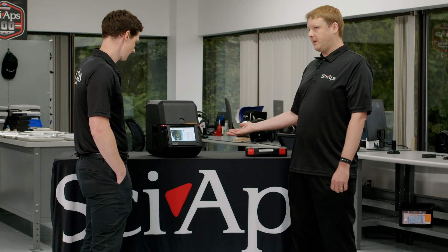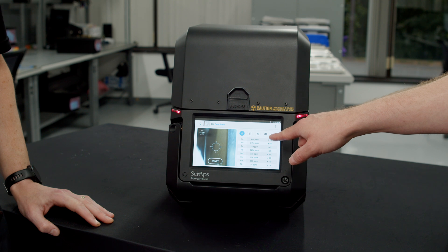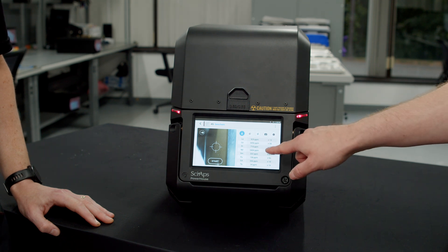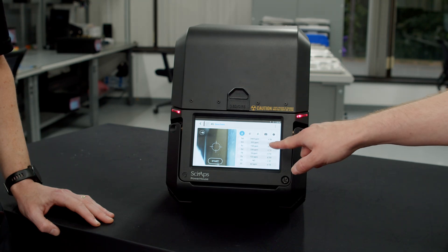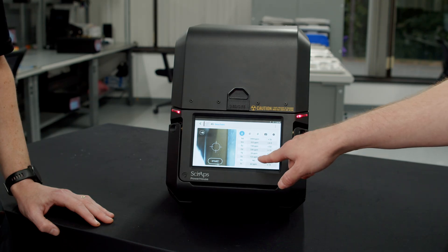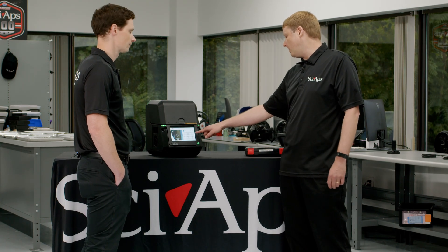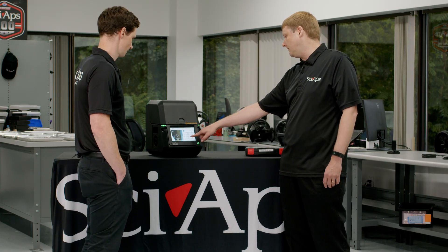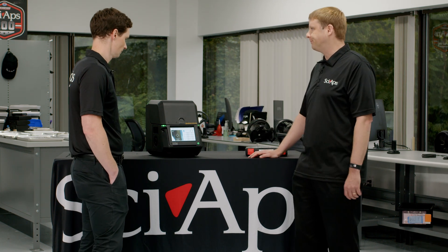This sample shows lower PPM levels of a bunch of rare earth elements. You have the light rare earths — lanthanum, cerium, praseodymium, and a few others — but it also contains lower levels of the heavy rare earths like europium, gadolinium, and terbium. It's testing all of those at the same time, as well as the base metals and light elements, measuring them down to low PPM levels. If it detects something, it'll tell you the measured concentration with the uncertainty, and if it's not detected, it'll give you ND for not detected along with the detection limit.